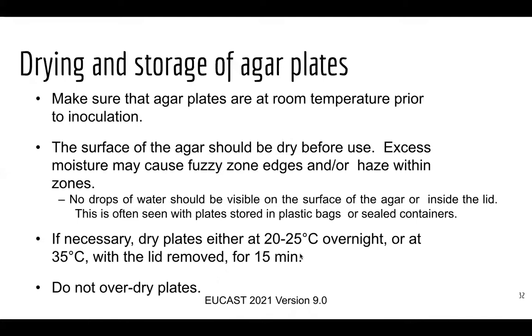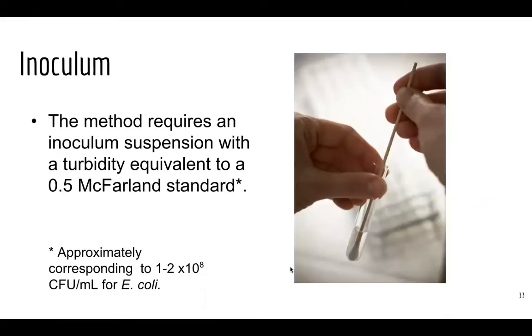Before you inoculate, it's always best to ensure they're at room temperature and that they're dry. We'll have a look at a video about that in a second.